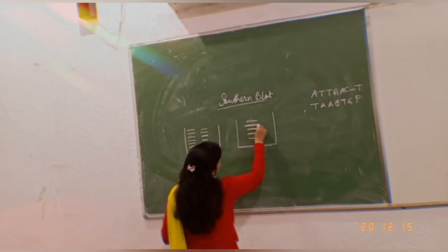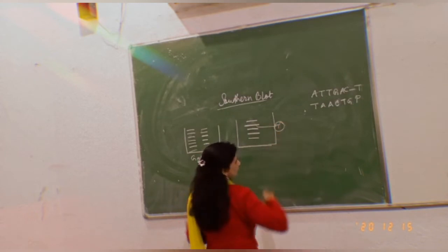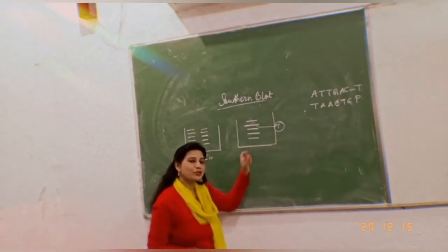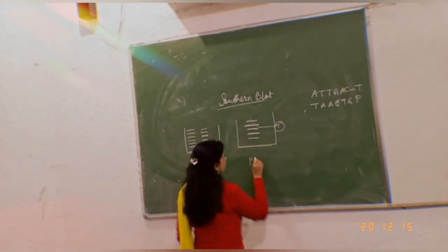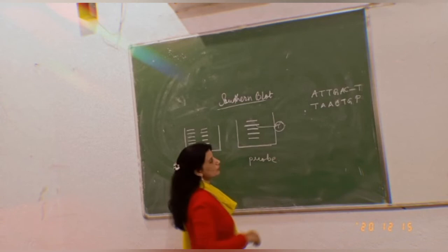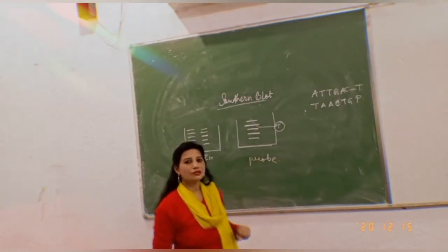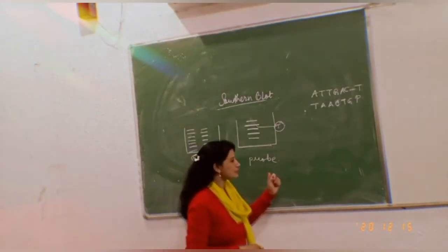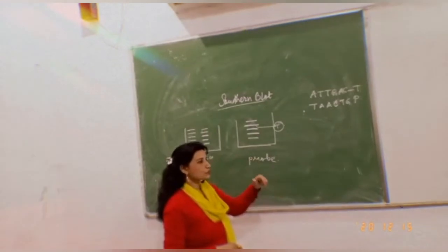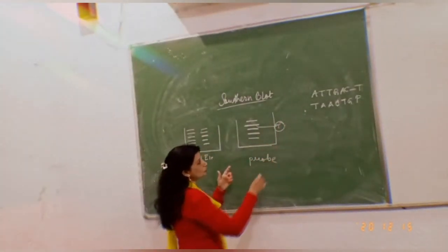Let me draw something, a length. Say my target sequence is here. Now I know my target is over here. But here also a particular spotting is required, because I'll be using the probe. Earlier I have talked about the probe. Probes are actually prepared in the lab. It is a single-stranded DNA strand. And this probe that I have prepared should be exactly complementary to my target, which has already been prepared. I have to use my probe now.